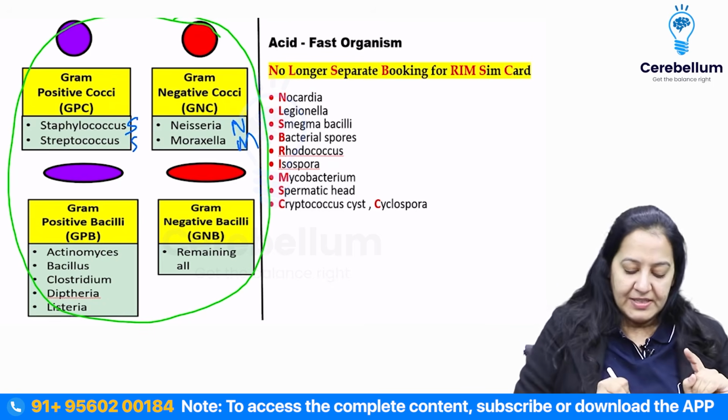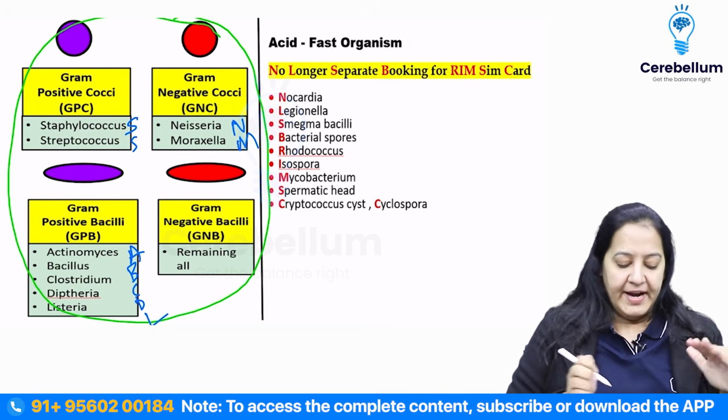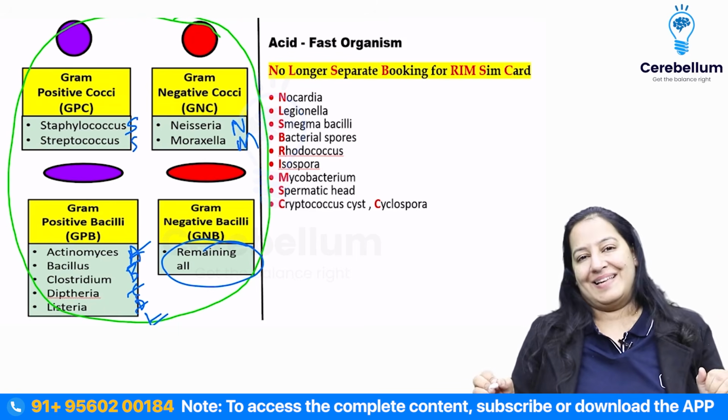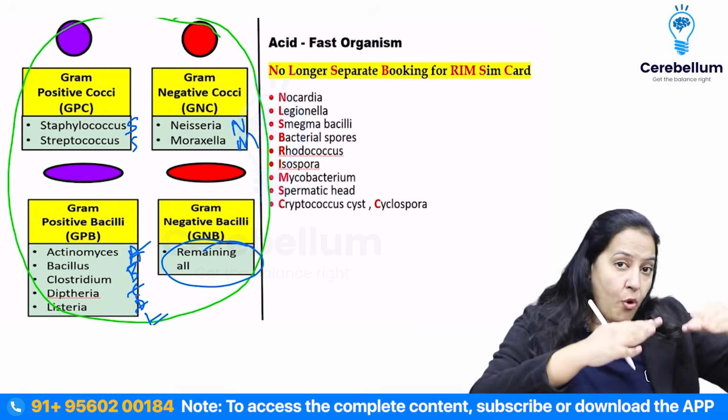The gram positive bacilli is A, B, C, D, L. You know the full form. It's Actinomycetes, Bacillus, Clostridium, Diphtheria and Listeria. And remaining all of them are gram negative bacilli. You got my point? So, that is about the gram staining. We divide the organism under 4 categories.